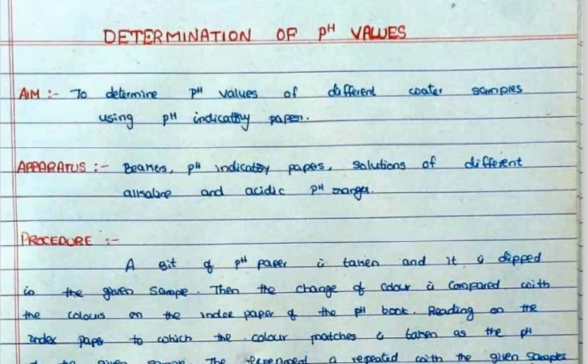Okay, next, determination of pH values. So the aim is to determine pH values of different water samples using pH indicating paper.